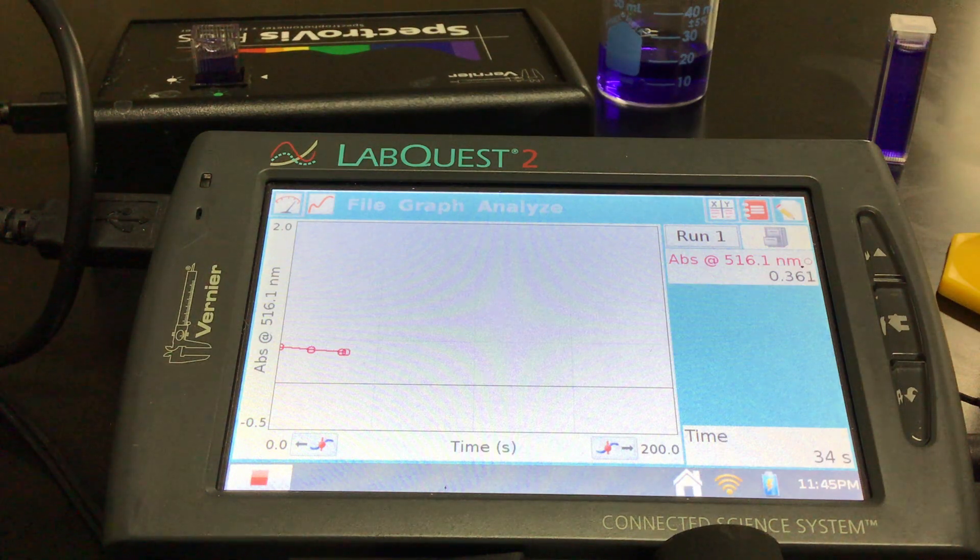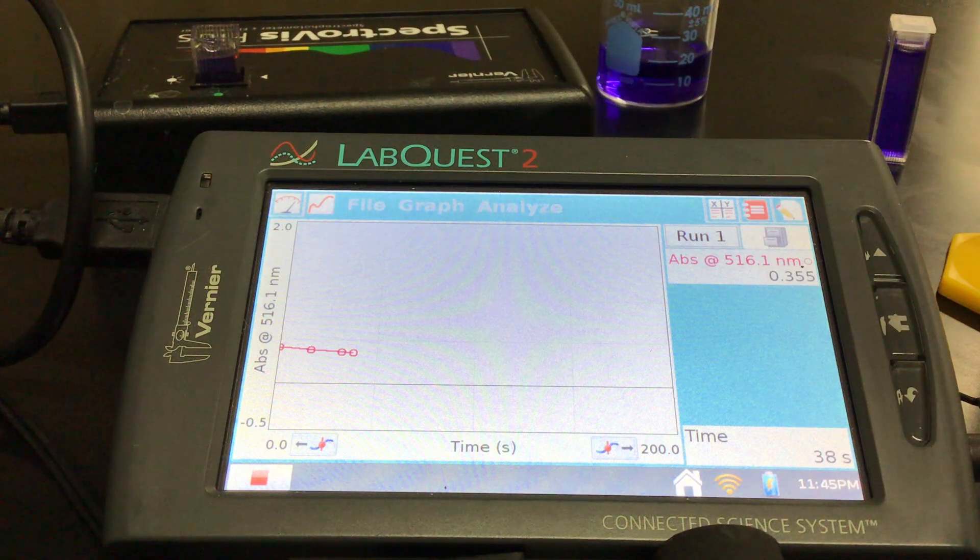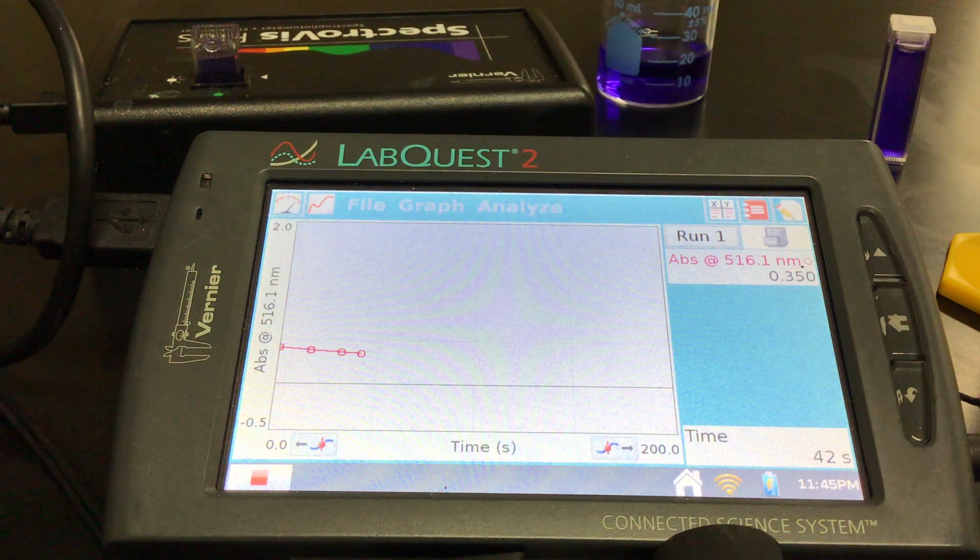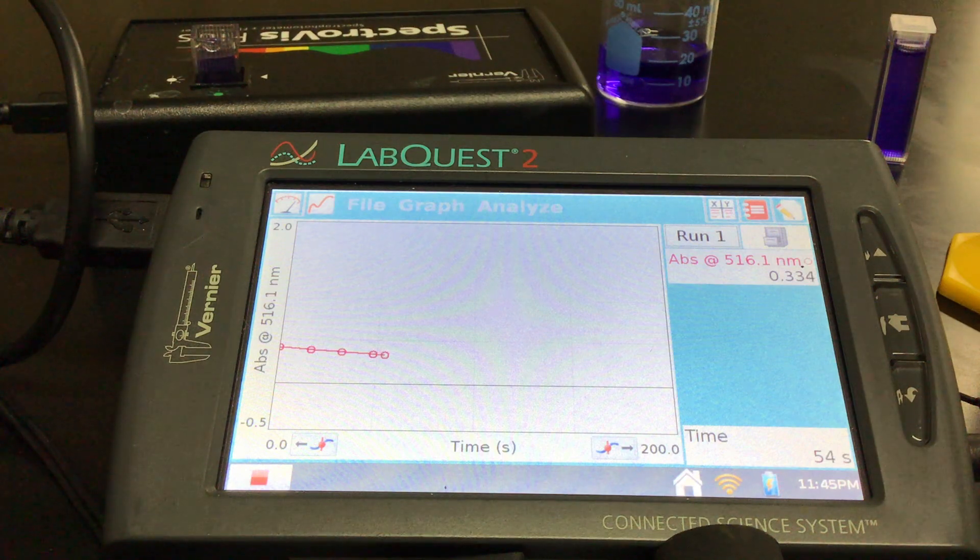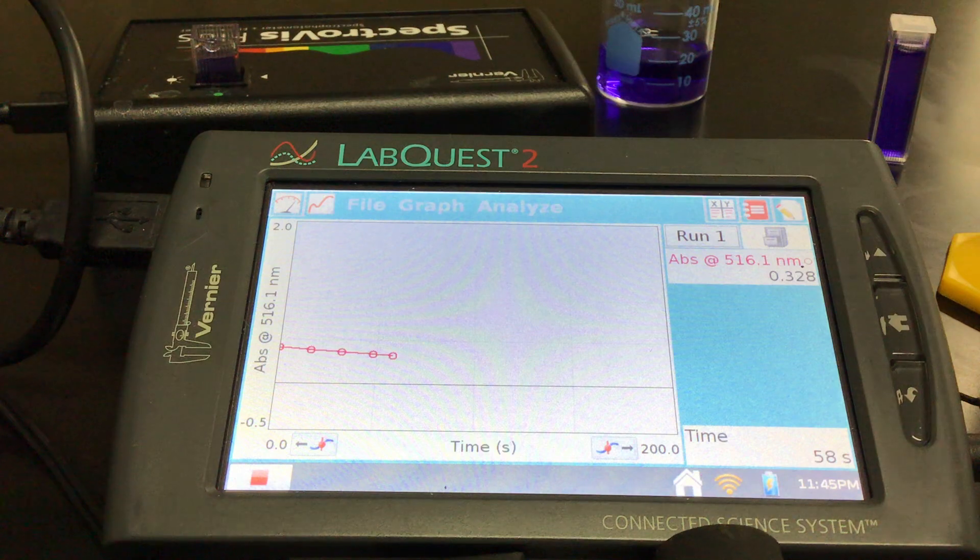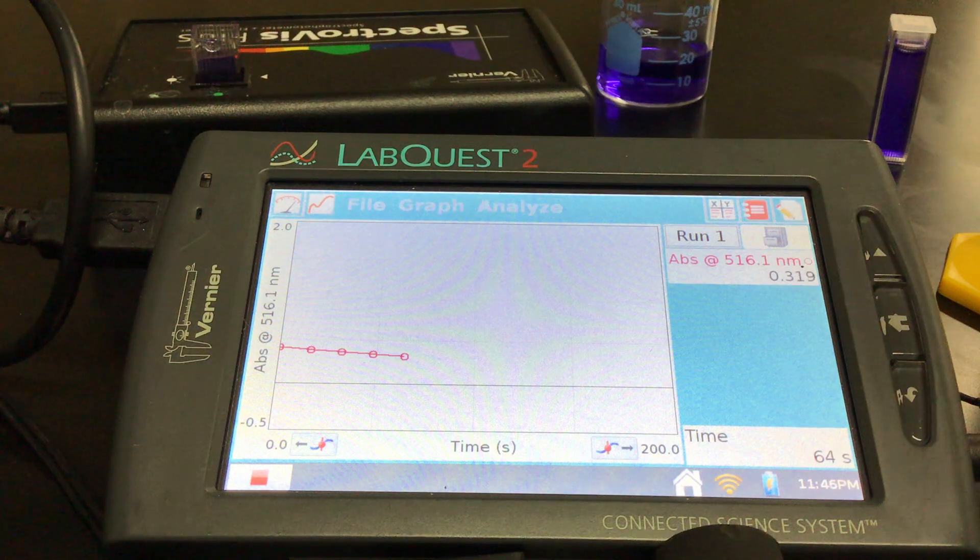When you're watching the video you can probably fast forward to the end once we see the shape of our curve. Once we get our data here, we determine where we're going to have the linear relationship. If it's absorbance versus time, we know that absorbance under one is proportional to concentration. If we get a straight line going down, that's going to tell us that it's a zero order reaction.